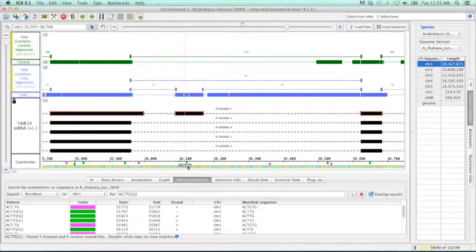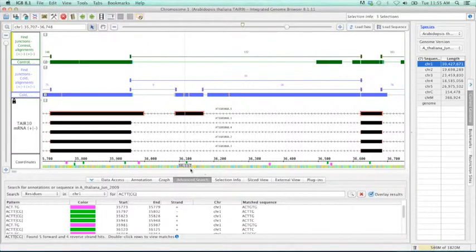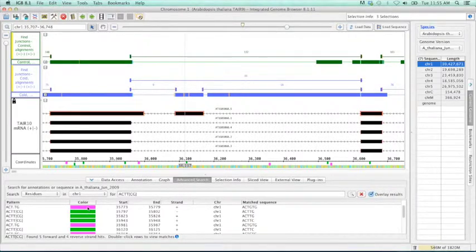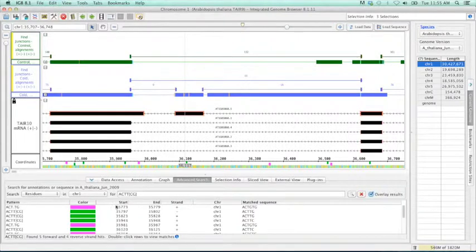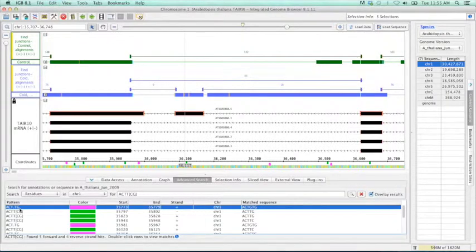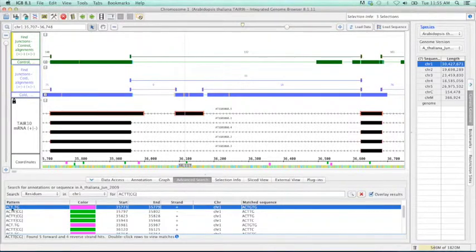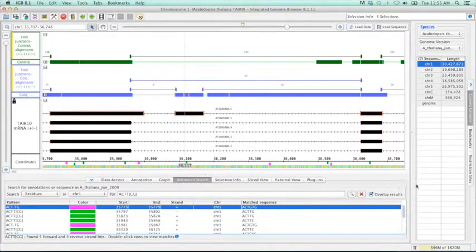Does the pink or green mean something? The color in IGBI currently is just determined by in what order you search for them. So this was our first search was the ACT wildcard TG.